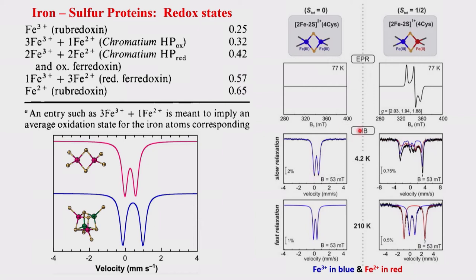Now come on to the right side panel of this, where you have one Fe2+ and one Fe3+. Obviously you get the mixture of both. At temperatures like 200 Kelvin, you get two distinct doublets, the outer and the inner. The outer red one is the Fe2+, the inner blue one is the Fe3+. You can basically find the Fe3+, Fe2+ in one particular spin state, essentially these ones in the low spin states, the high spin states.